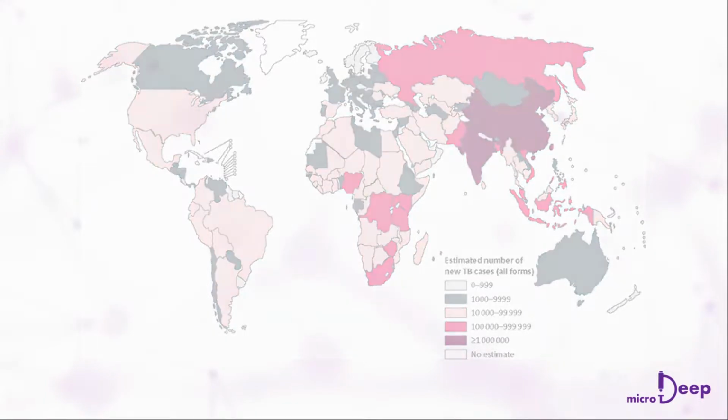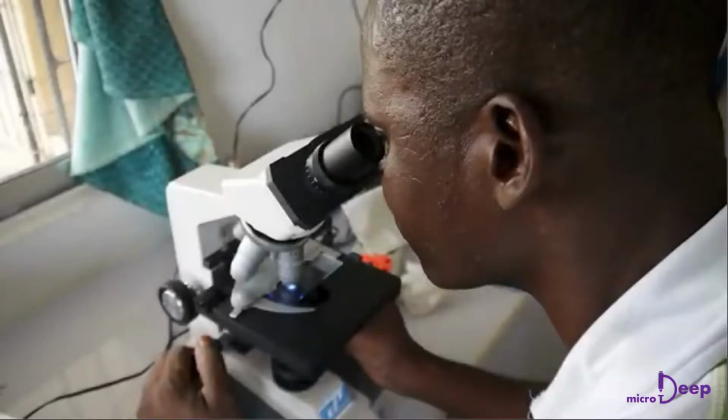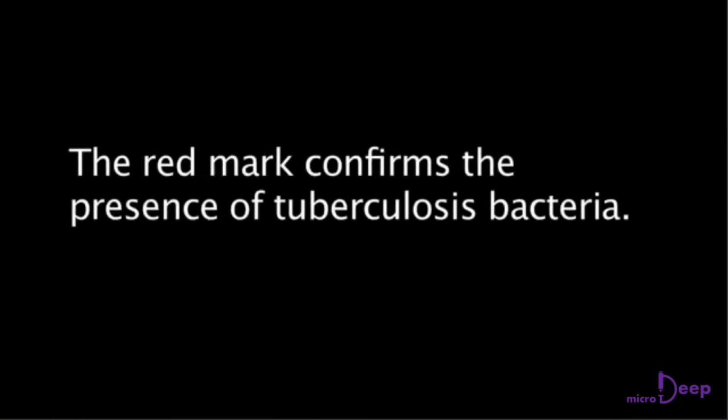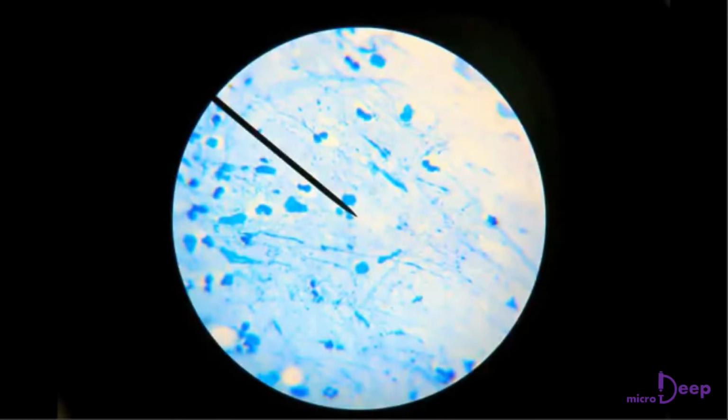One of the most widely used tests for TB diagnosis in developed parts of the world is the microscopic examination of Ziehl-Neelsen. However, accurate diagnosis depends on the availability of experienced, skilled lab technicians, which is a problem particularly in remote, rural, and resource-limited regions that are mostly affected by the disease. Yet, early diagnosis of tuberculosis can lead to quick treatment that delivers wider opportunities to reduce its deadly effect.